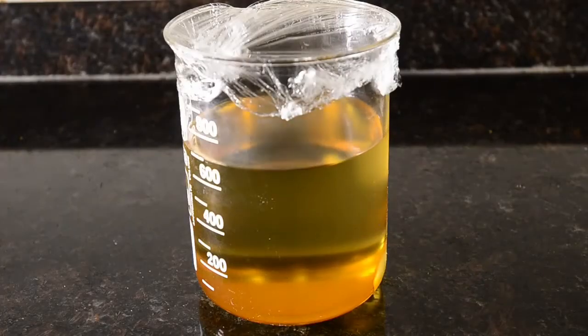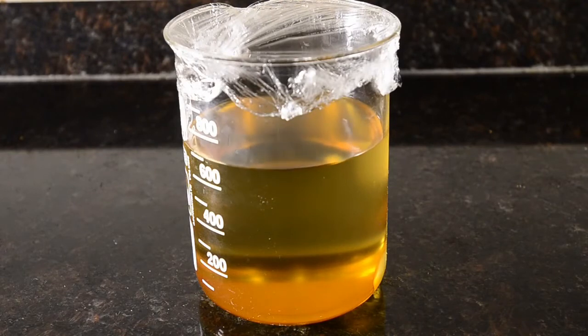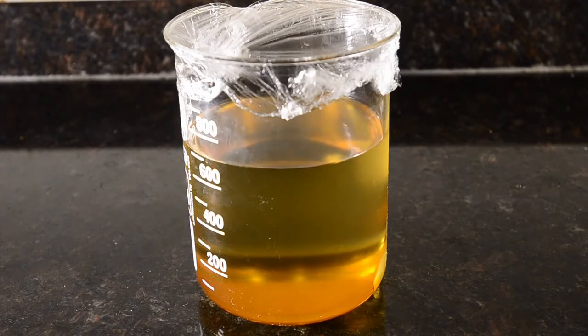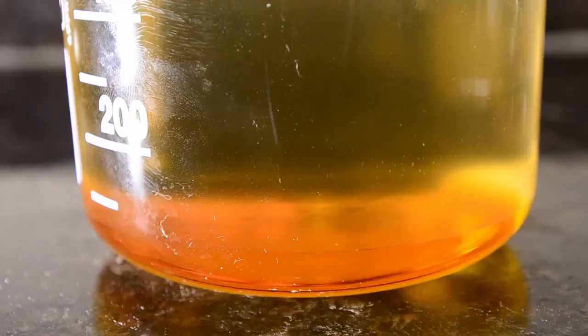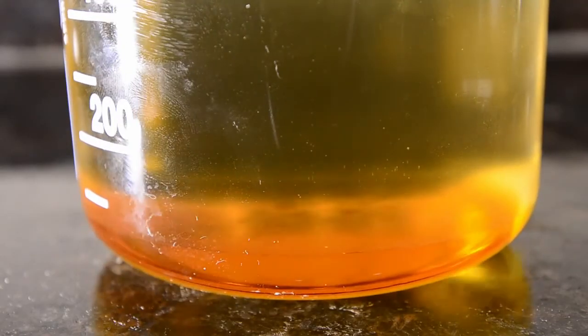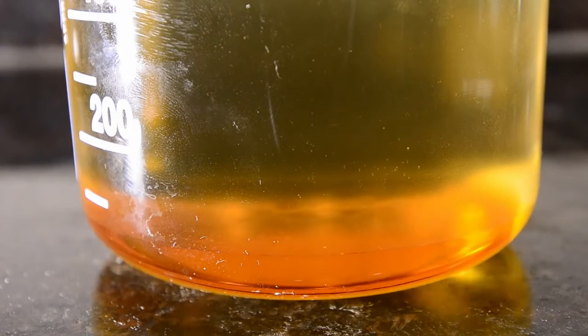Then switch off the stirring and allow to separate. You should see a viscous bottom layer separating out. You can see that the top layer is now a lot more fluid than the starting oil. The bottom orange layer is glycerin produced by the reaction, containing some impurities.